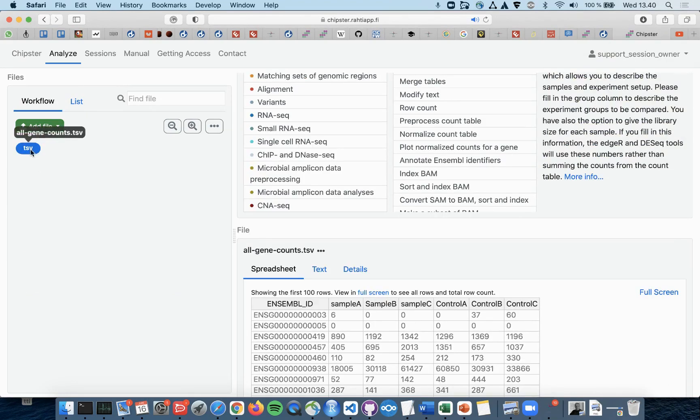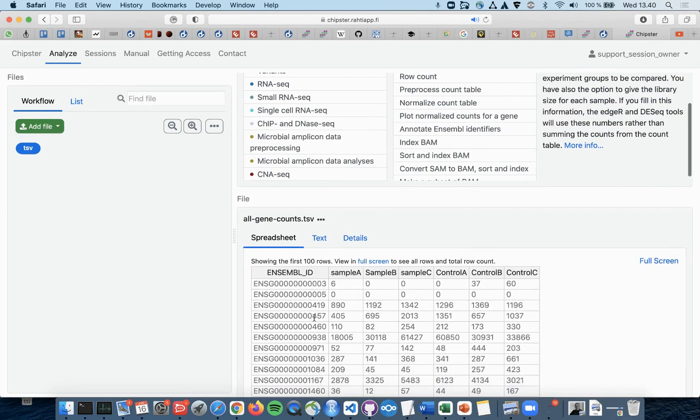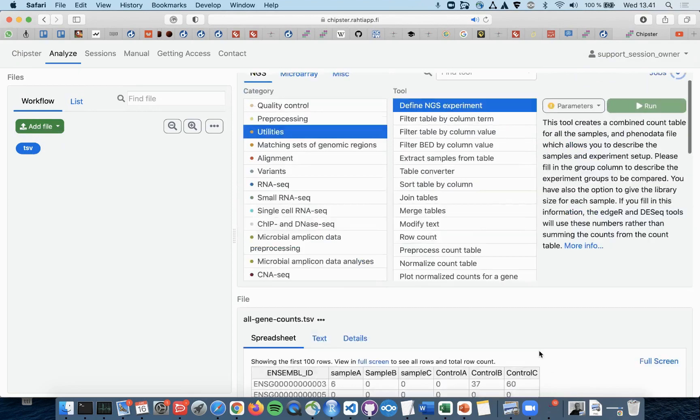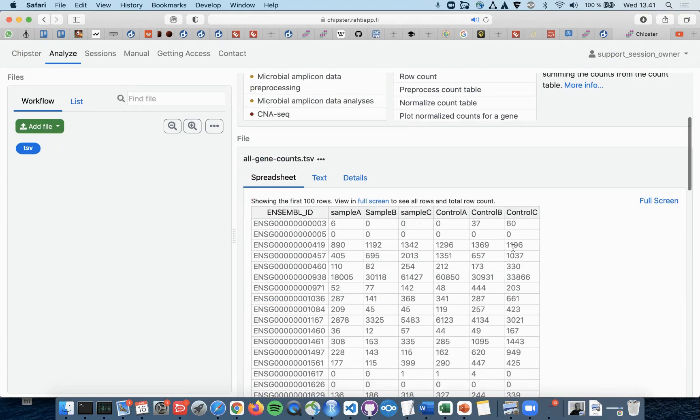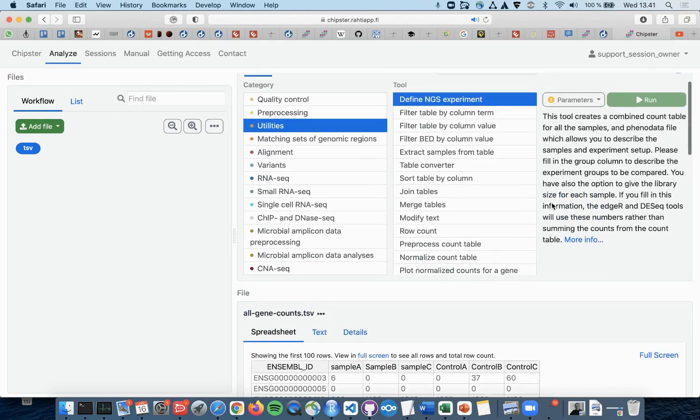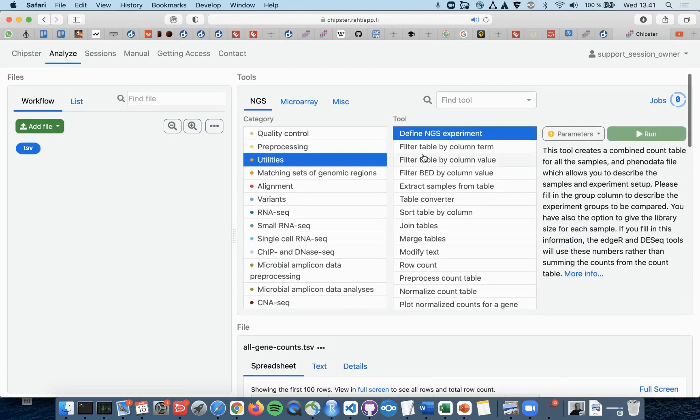However, you might already have a joint count table with all the samples in it. In this case, you can't use the Define NGS Experiment tool as it is expecting several input files.